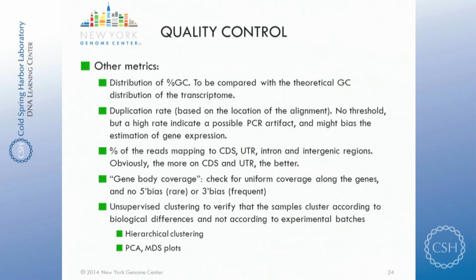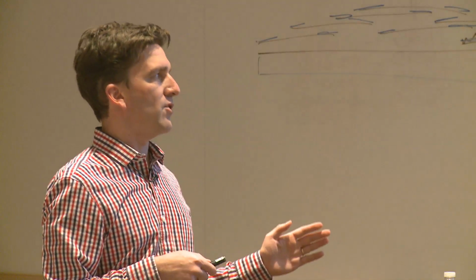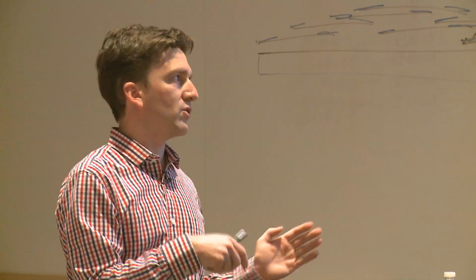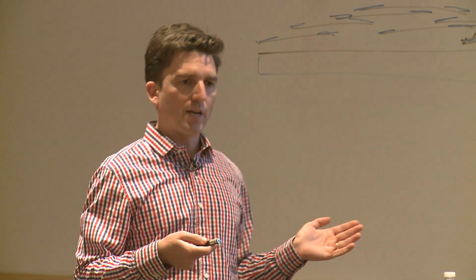The last one is not actually part of those tools, but I suggest doing an unsupervised clustering of your gene expression. You have your count matrix, all the counts or all the RPKM for each sample and each gene, and you do an unsupervised clustering to see if the samples cluster according to some biological expectation or according to experimental batches.